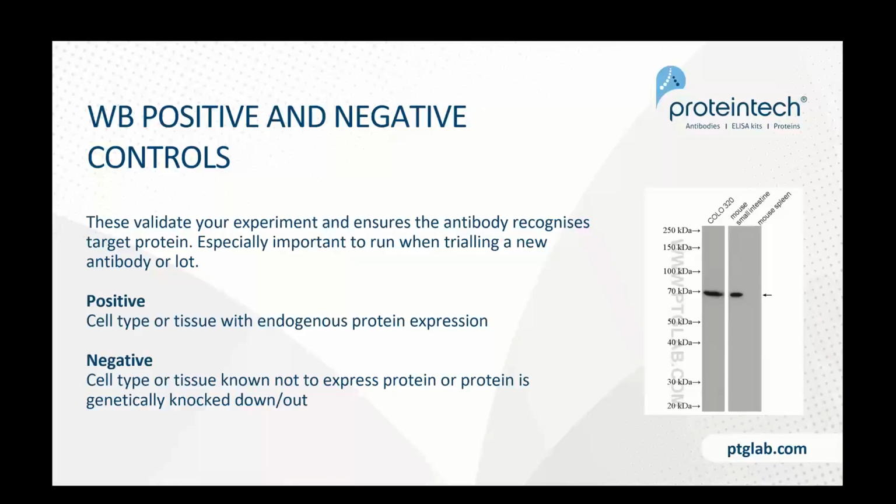Negative controls can be a little bit more challenging. Most cells express a lot of proteins at low levels, and so it's sometimes very challenging to find a cell type or tissue that does not express the protein using those resources I mentioned before. So the best one to use is one where it's been genetically knocked down or knocked out with CRISPR or siRNA. On the right here, I show an example where, for this particular target, the mouse spleen does not express it, so it's a great negative control for this particular target.